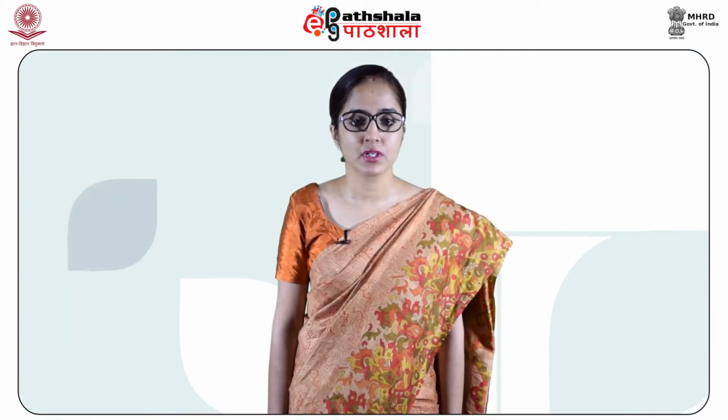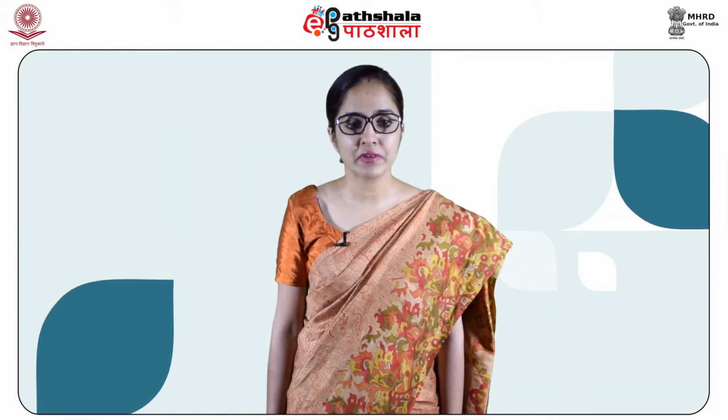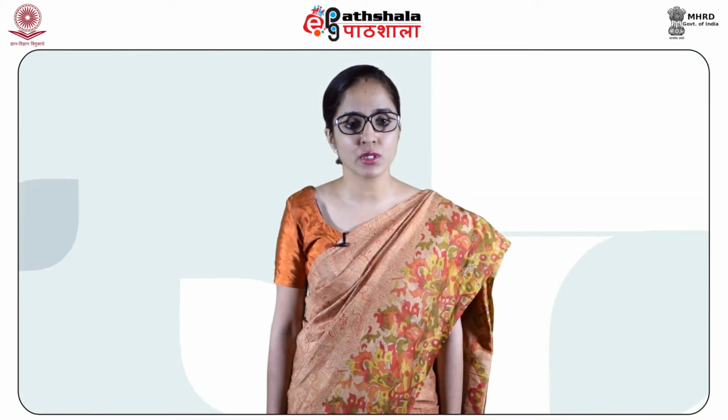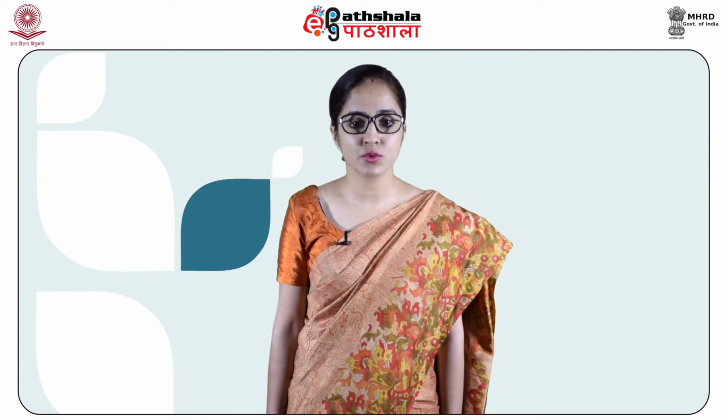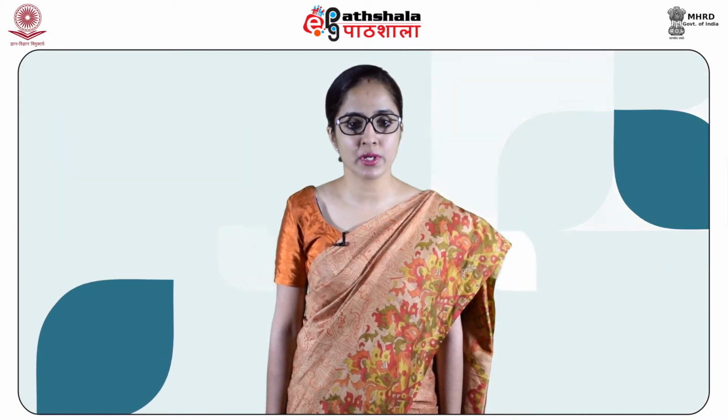Dear students, today in this module we would like to tell you how infrared spectroscopy goes beyond, being used not only for organic chemists but also for many other fields. Infrared spectroscopy is a simple and reliable technique which is widely used in both organic and inorganic chemistry. It is also used in quality control analysis in industrial, scientific and medical applications.